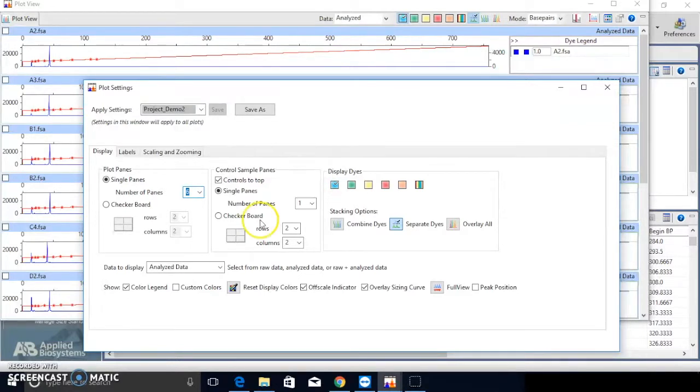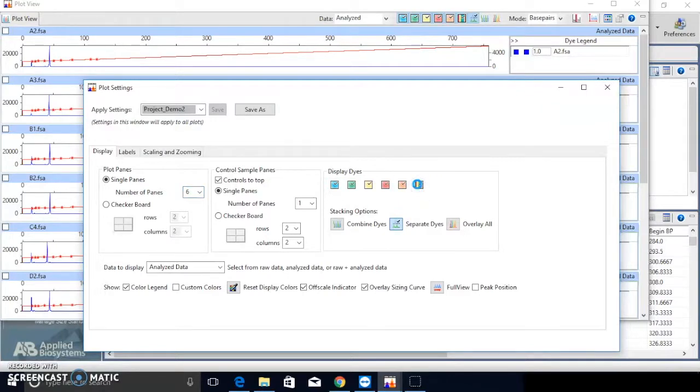I choose only die B for Plot since the oligos are only labeled with FAM, with separate die as view.